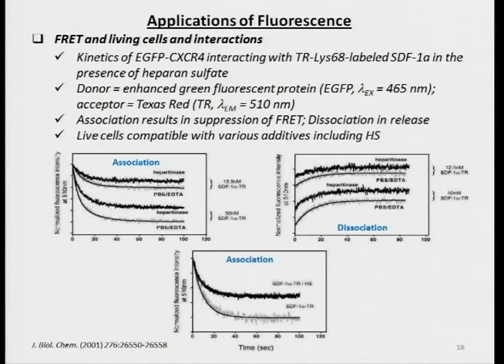Here's a system that Project 3 people will probably appreciate. So they studied FRET analysis of CXCR4 with SDF1 alpha, a chemokine, in the presence of heparan sulfate.